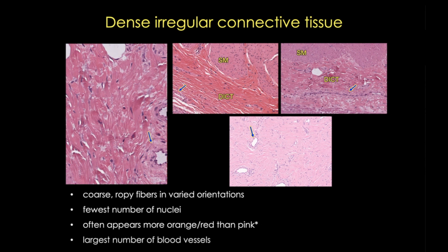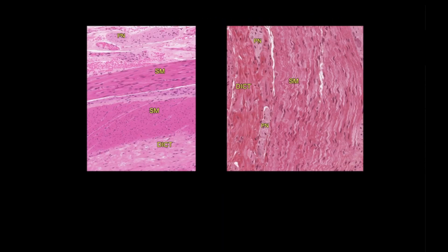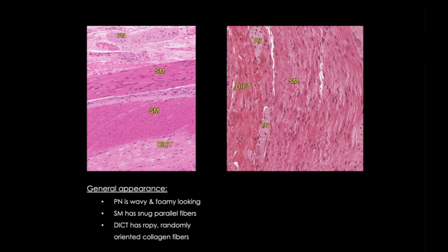To compare, let's look at some sections that have all three tissues. Here in these two sections from the duodenum, I hope that you can now appreciate the wavy, pale nervous tissue, the parallel fibers of the smooth muscle which stains quite darkly, and the many irregular collagen fibers of the dense irregular connective tissue. Remember also that, generally speaking, smooth muscle will stain the most intensely, while dense irregular connective tissue has the fewest number of nuclei.